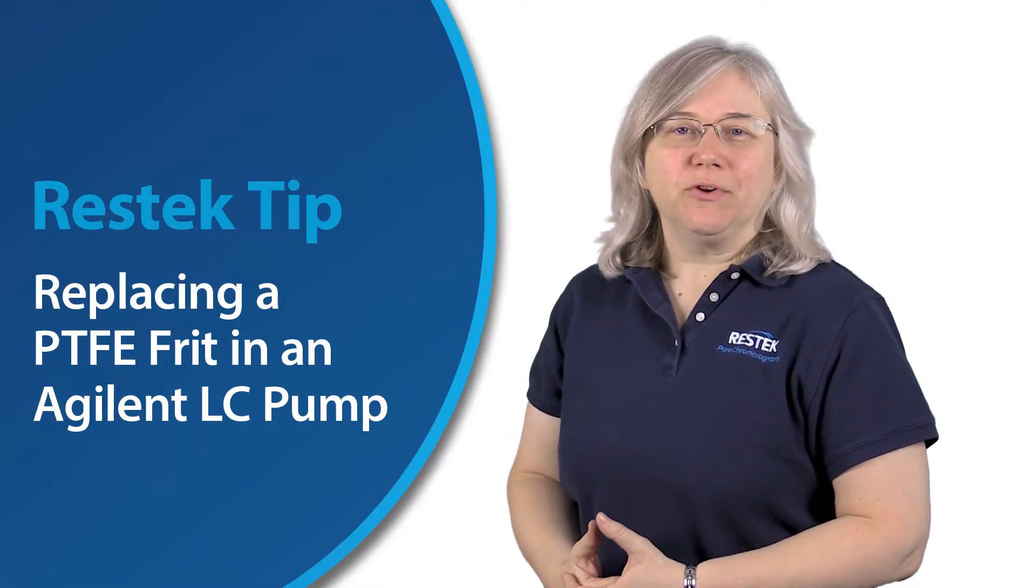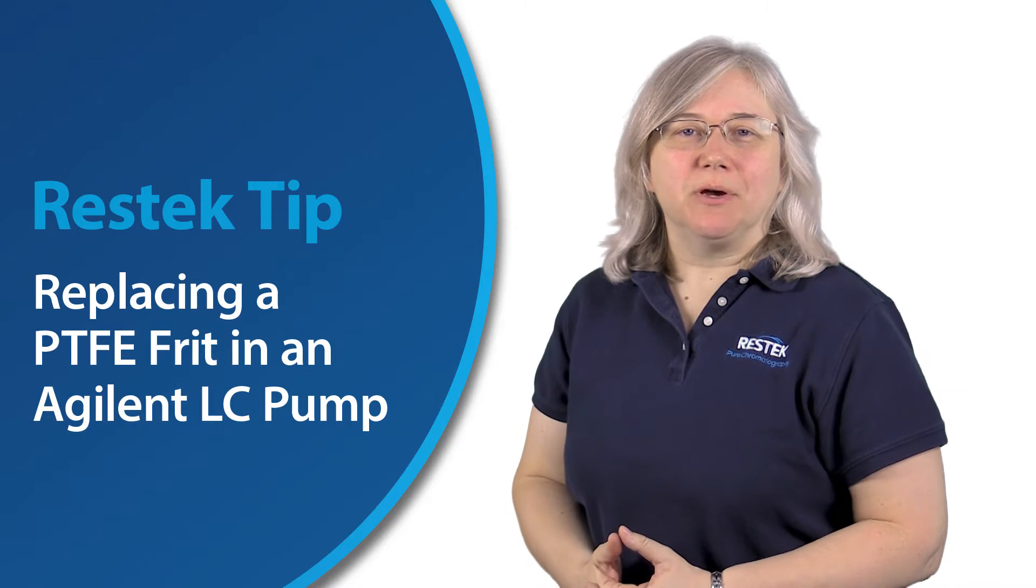Hi everyone, thanks for joining us for this ResTech tip. Our topic today is PTFE frit replacement in the Agilent series pumps.